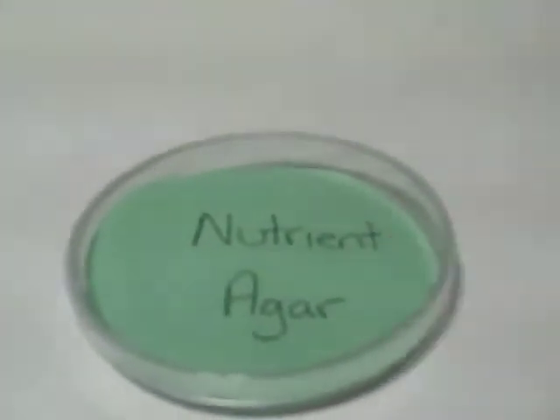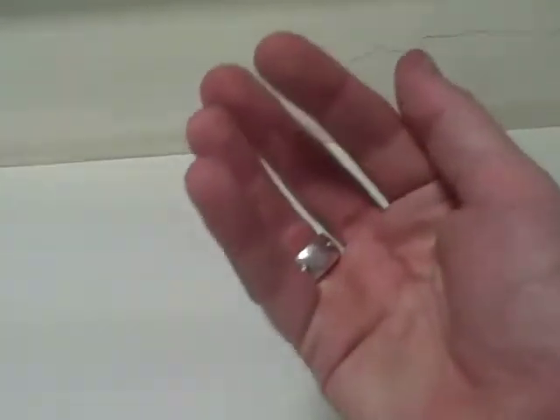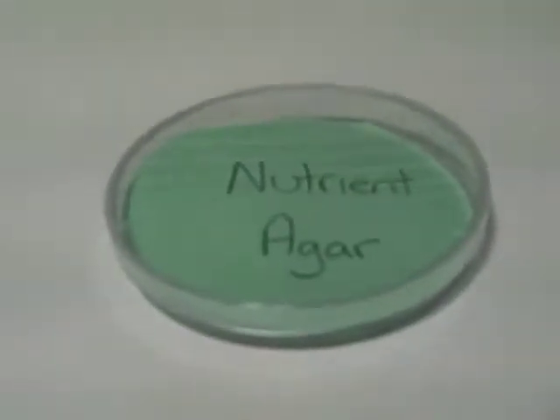We don't want your hand touching the agar plate. You'll infect it with bacteria from your hands, and we don't want that. Your hands may well be carrying diseases. One of the rules about this is that we don't sample the human body. Now the way we sample is we take sellotape, never been touched before, and use that to sample.